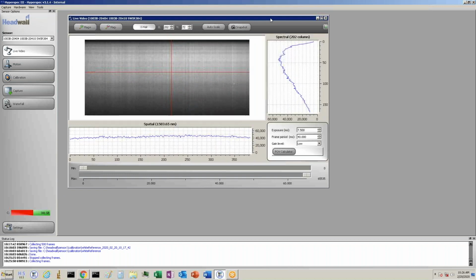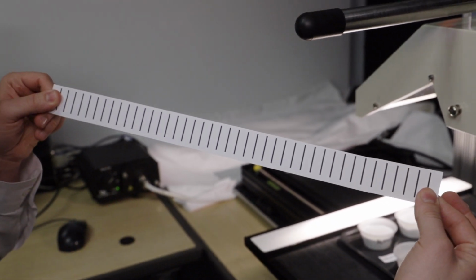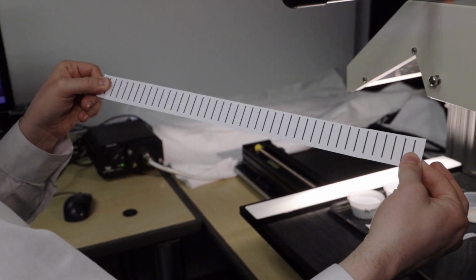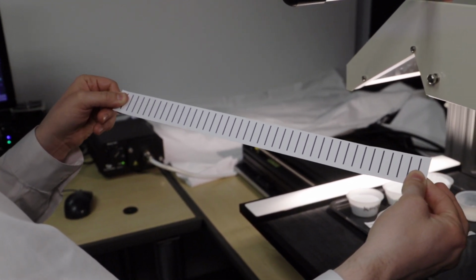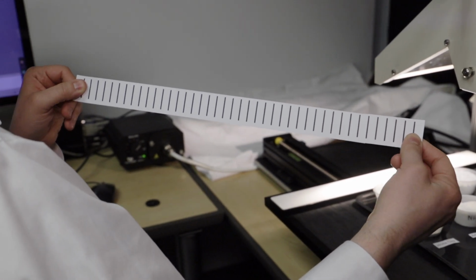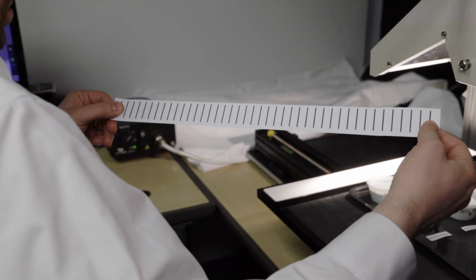I'm going to start off by adjusting the focus of the camera to make sure that I'm focusing on the same plane as my sample. And usually to do this focusing, I use a handy-dandy target that is a bunch of periodic black lines that allows us to easily focus a line scanning camera, which is harder to focus than your average 2D array camera.